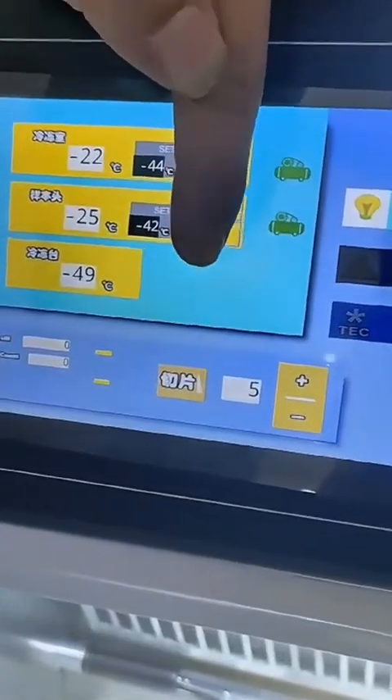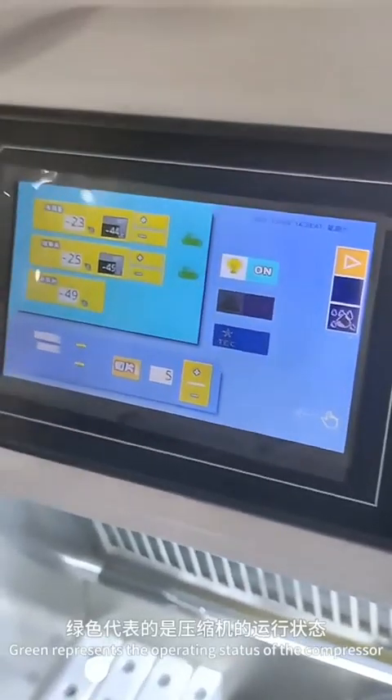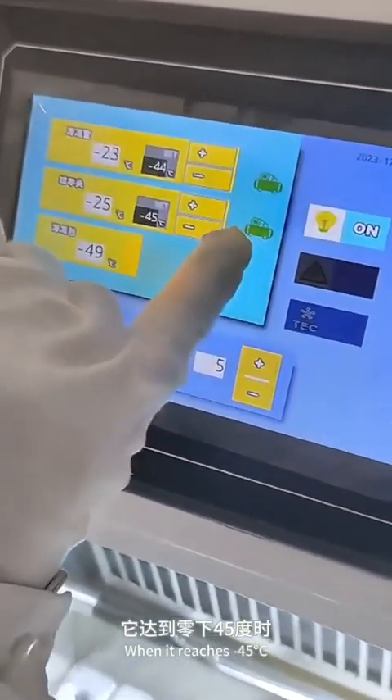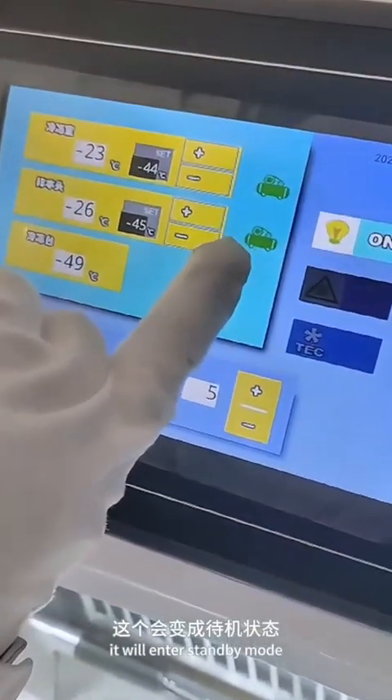Green represents the operating status of the compressor. When it reaches minus 45 degrees Celsius, it will enter standby mode.